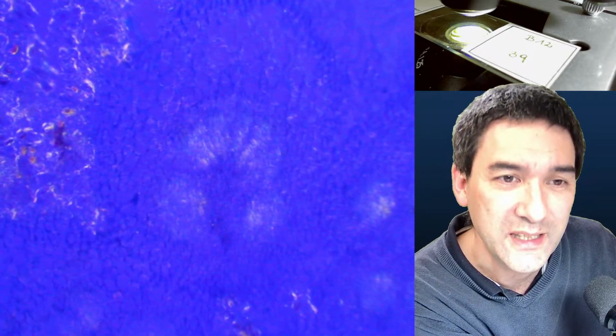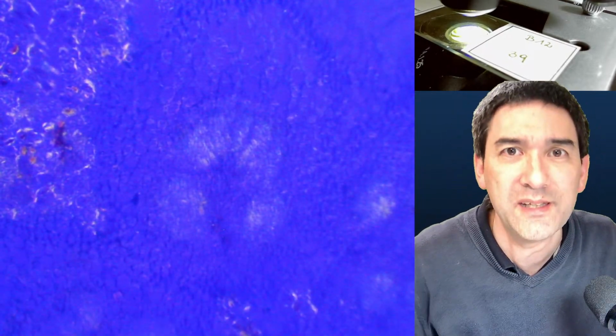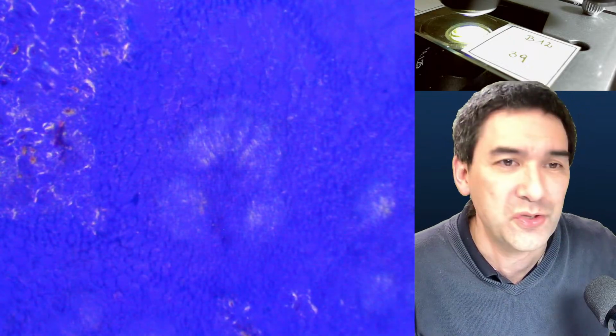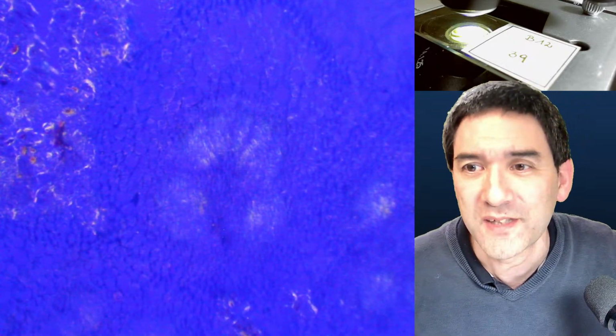So I know this is probably not the most exciting specimen, I just wanted to show you that, besides making it appear beautiful, Rheinberg can also be used to distinguish different types of cells.